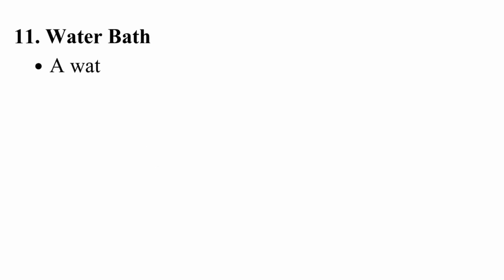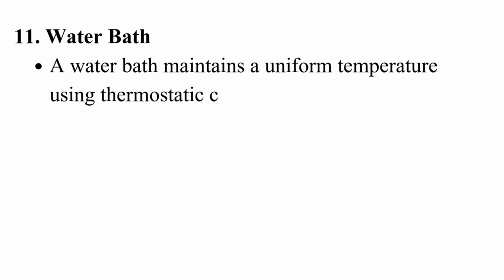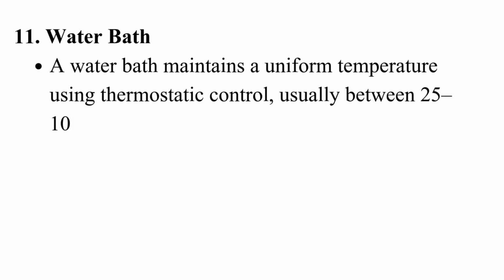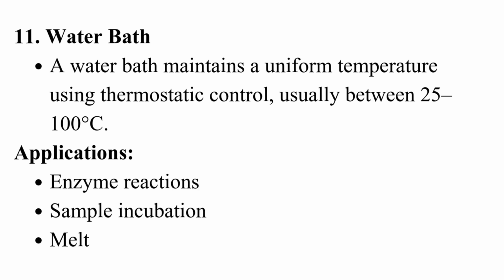Water bath. A water bath maintains a uniform temperature using thermostatic control, usually between 25 to 100 degrees Celsius. Applications: enzyme reactions, sample incubation, melting agar and media.